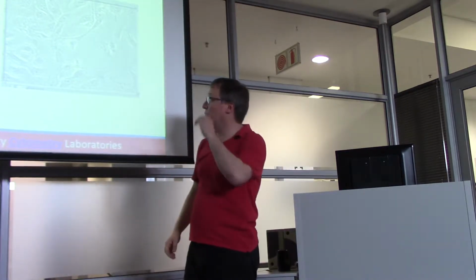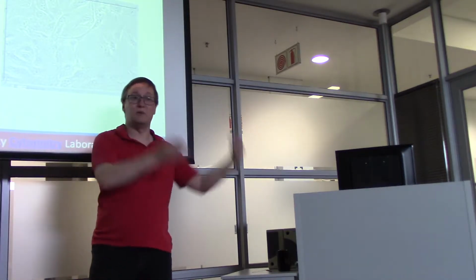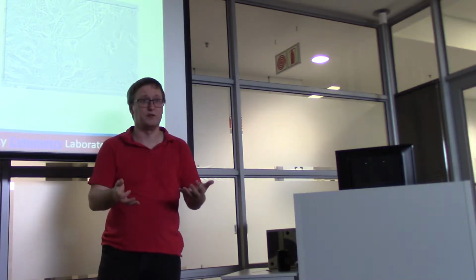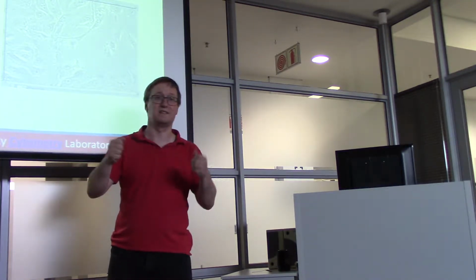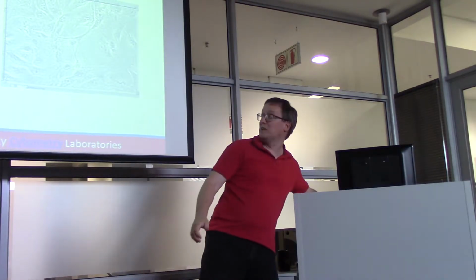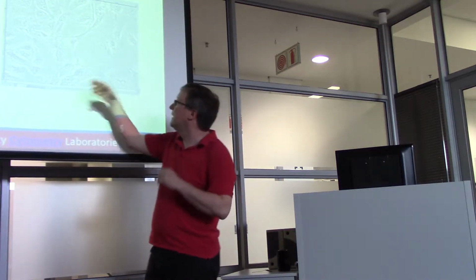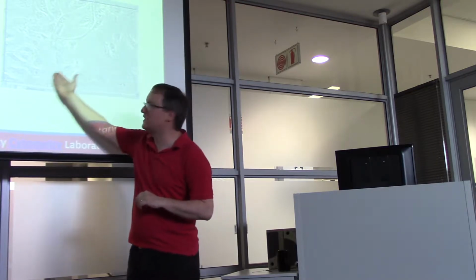So one of the things that we can do is to alter how our input brightness maps to an output brightness. We're going to apply a brightness and contrast filter to it that is going to allow us to change which brightnesses get mapped to what. And so if we flip back and forth between the first image and the right, we see that we got brighter. But we still have this problem that there's not a lot of contrast.